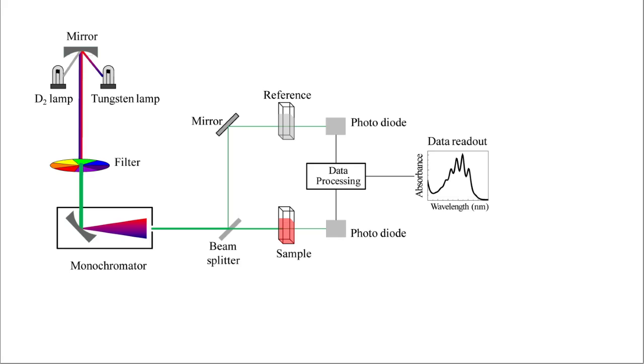The image shown is a representation of the process that is carried out during UV-VIS spectroscopy inside the machine. The two lamps send out a light that is bounced against a mirror, the lamps in the example above being deuterium and tungsten. Deuterium is a good lamp for analyzing compounds for ultraviolet due to its low pressure gas discharge. Tungsten lamps have a filament inside them that is heated to a very high temperature, making them glow with visible light, which is used for the visible light spectrum portion of the test.